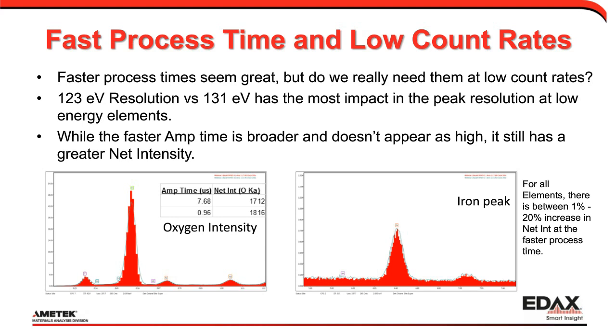Now we're just talking a few percent. I think it's a difference between 5% and 0.5%, but certainly we like to have even the small benefits, and you can see by the peak intensity that we are gaining something when we go to the fast processing times, but we're really not losing anything in terms of peak intensity.